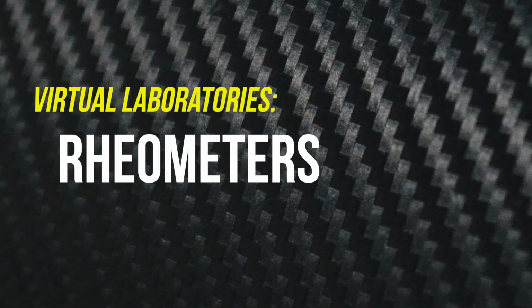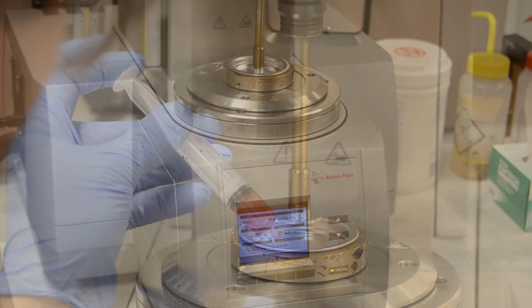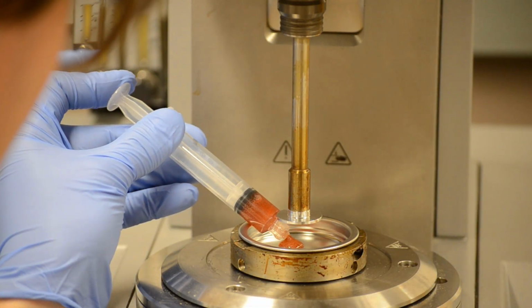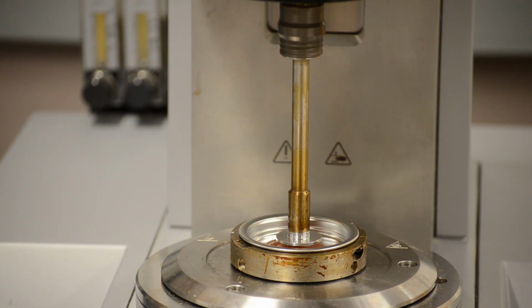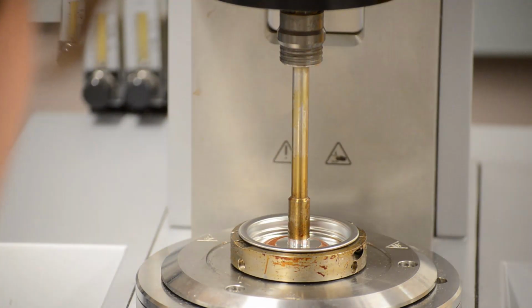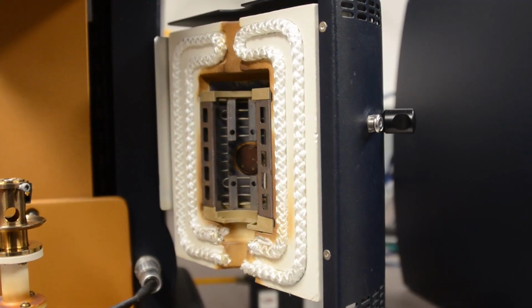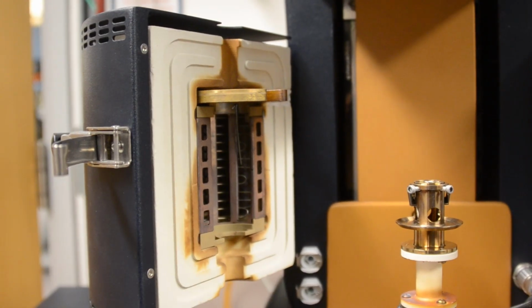In this video, we will explore some features, common uses, and operation of a rheometer. A rheometer is an instrument that can apply forces or strains to a small sample and measure the resulting displacements or forces. Samples are typically measured dynamically, and the method varies based on the test being performed. Rheometers also feature systems to control the temperature of the sample and the environment which it is exposed to.